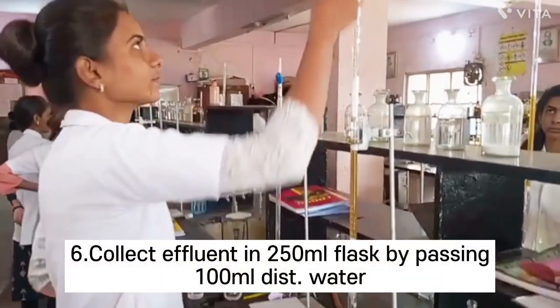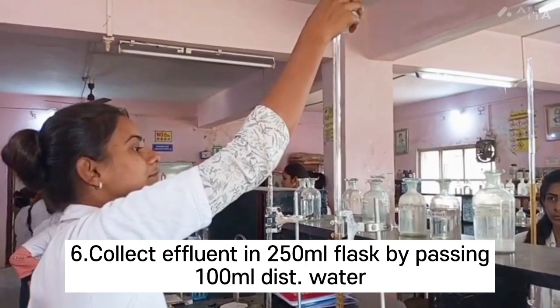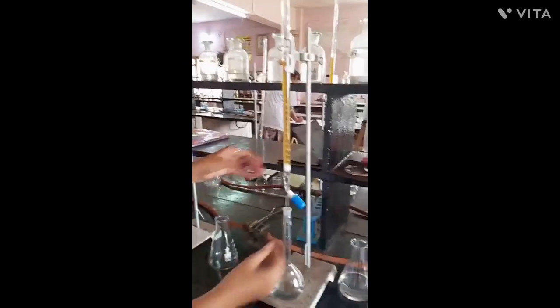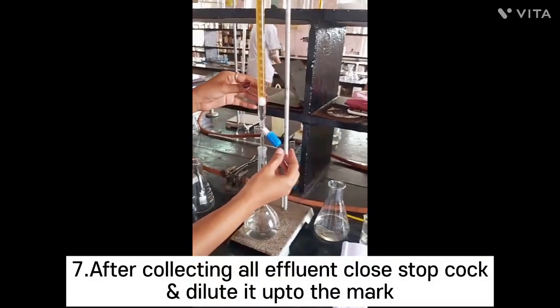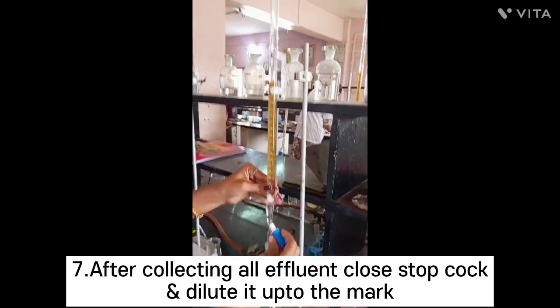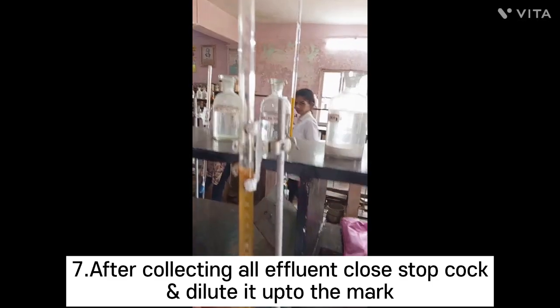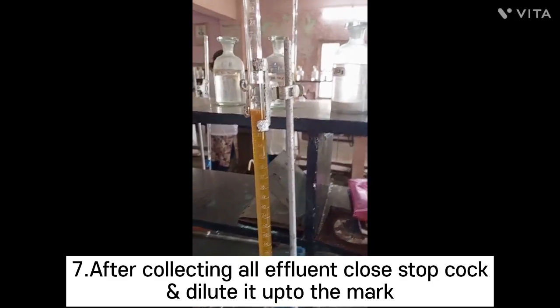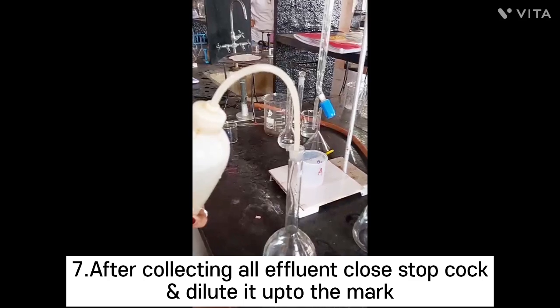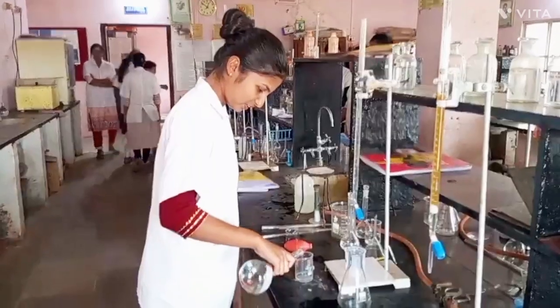Collect the effluent in a 250 ml standard measuring flask by passing 100 ml distilled water. As all the effluent is collected in the 250 ml standard measuring flask, close the stopcock so that the water level remains above the resin bed. Dilute the content of the flask up to the mark using distilled water.